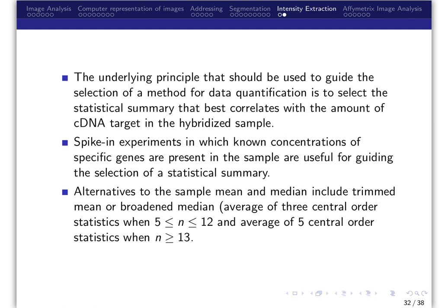When performing intensity extraction, the underlying principle used to guide selection of a method for data quantification is to select the statistical summary that best correlates with the amount of hybridized DNA target in the sample.